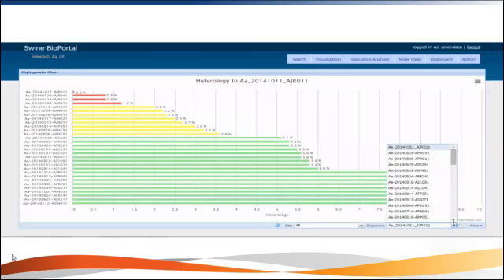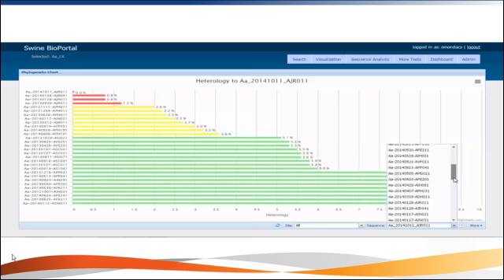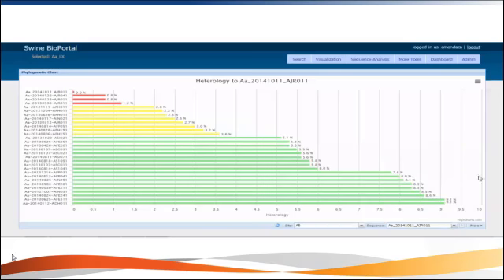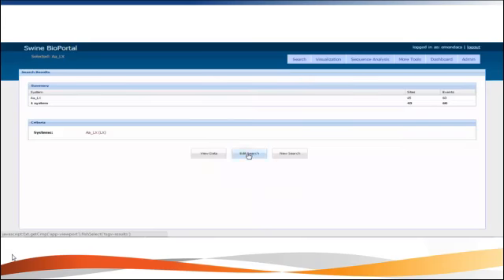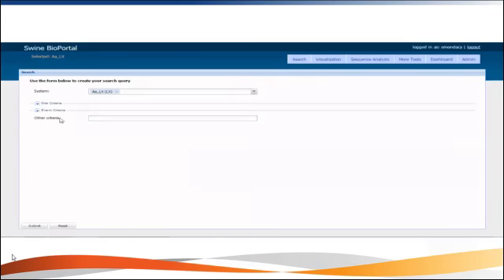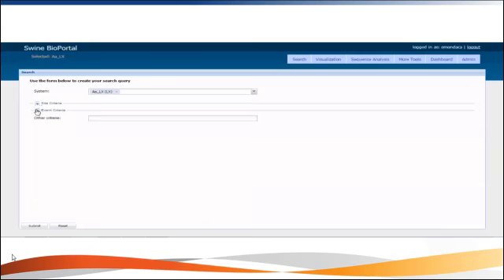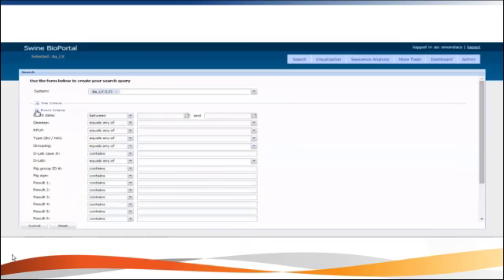In this case, all of these sequences are at a given distance from the sequence of interest. Of course, we can select from our database any of the sequences available there from last year or early this year, whatever, and everything will be compared to that specific sequence. We can also do some filtering. From the huge database that we could get, we can select some specific fields. Perhaps we only want to see a specific period of time or a specific type of facilities, only nurseries or sow sites, or in this case some type of grouping.